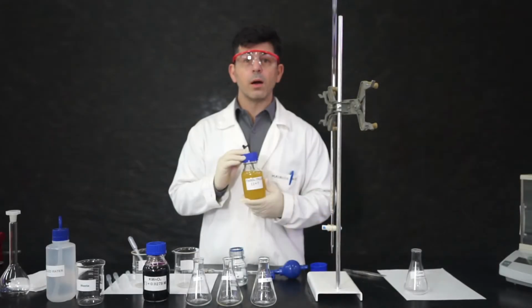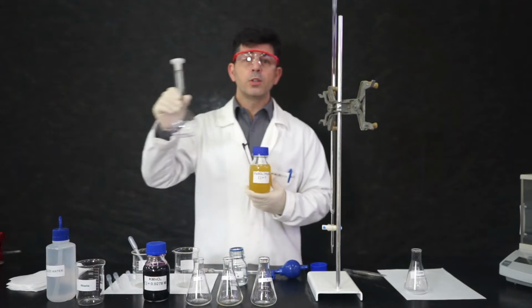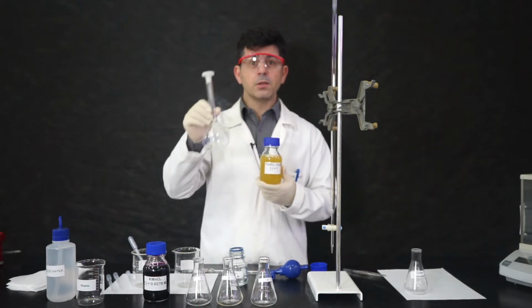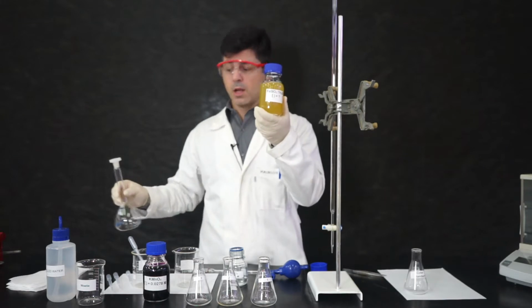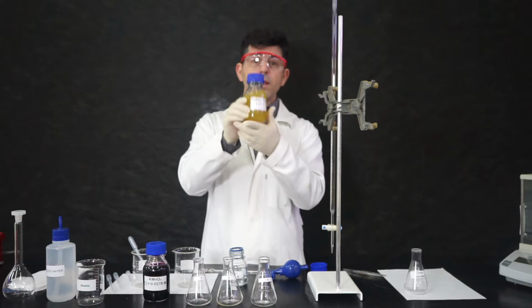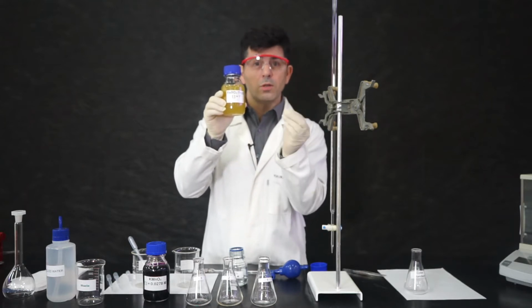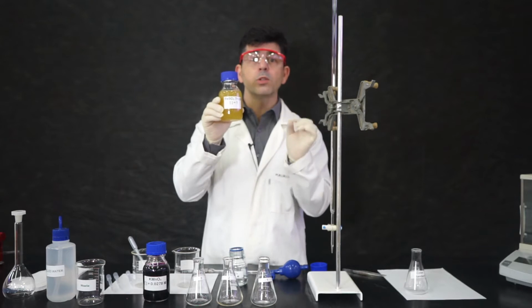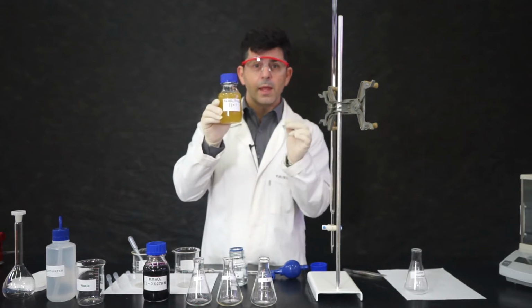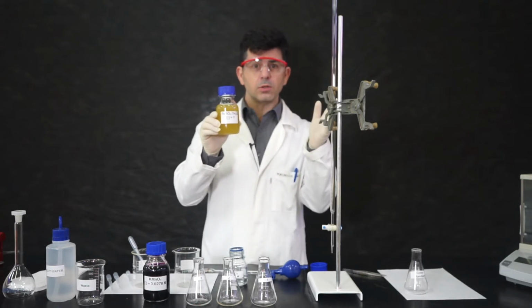So we dissolved that ore in sulfuric acid. We transferred it to a 250 milliliter volumetric flask. And then the solution is now in this flask. All the iron that was in that piece of ore is in here now and has a certain concentration. Remember, we're talking about 250 milliliters of solution. We will analyze this solution through the titration.